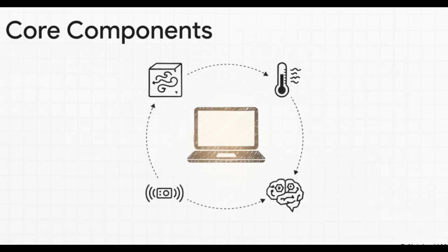It bidirectionally communicates with the physical environment so that it's always perfectly synchronized with real-world conditions. And these 4 core components are what work together to render that invisible, turbulent airflow entirely visible. First, you've got a computational fluid dynamics, or CFD, engine solving really complex transport equations. Then, you layer in thermal mapping. This is vital because heat from equipment, lighting, and humans creates little convective micro-recirculation zones that totally disrupt unidirectional airflow. Next, you integrate continuous data from IoT sensors, particle counters, and temperature probes to feed the model. And finally, predictive machine learning analyzes all that historical data to actually anticipate excursions before they even happen.